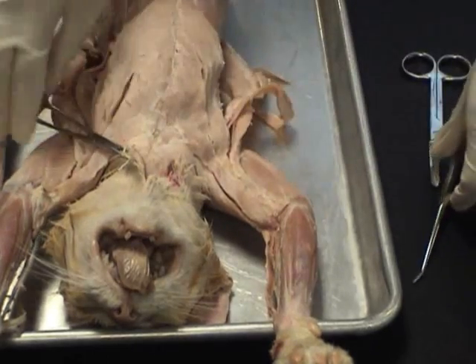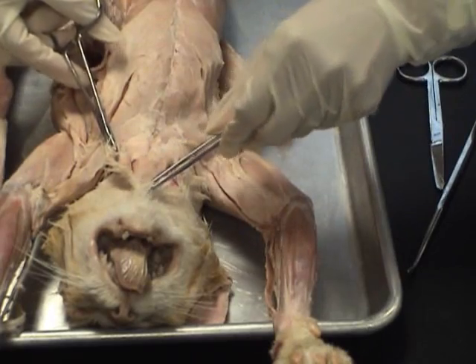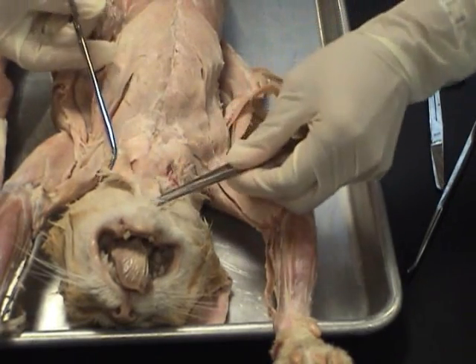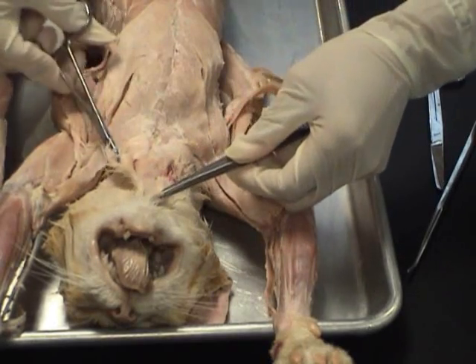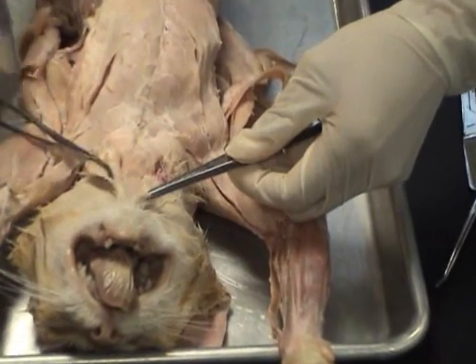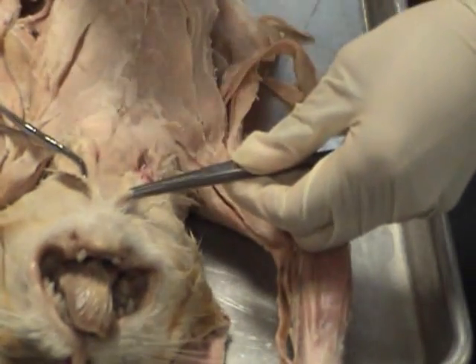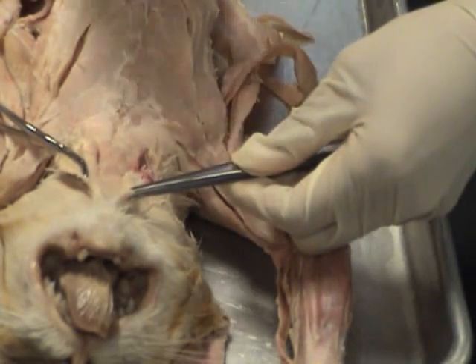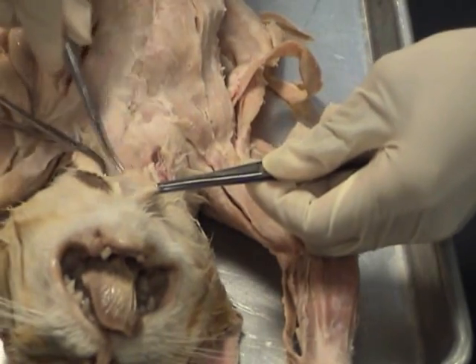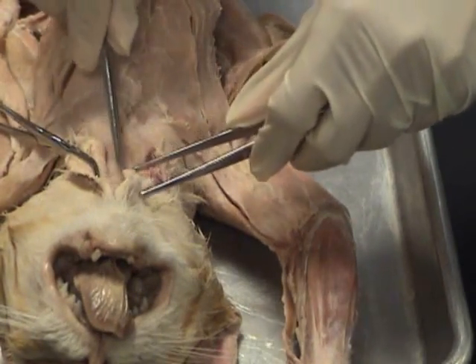At this point, I can use the other pickup, and now we can see there's a lot of connective tissue underneath here that we have to remove. At this point, you can use the probe once again. Always do blunt dissection because you do less damage. And with the blunt probe, I can do this and break the connective tissue underneath the pelt.